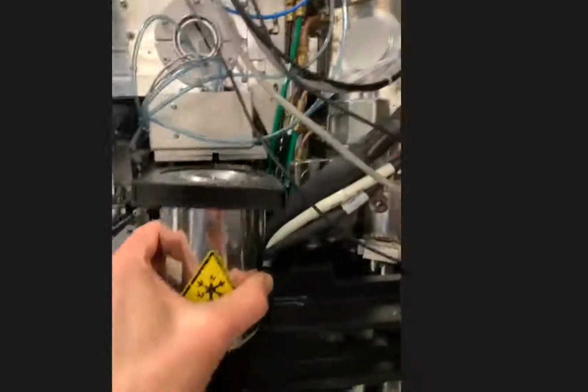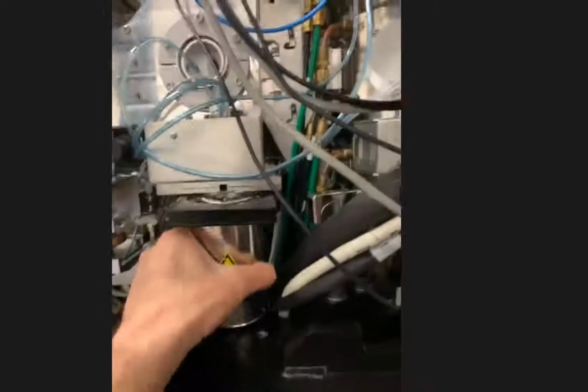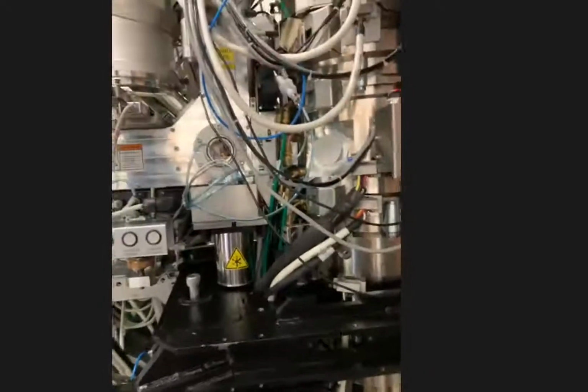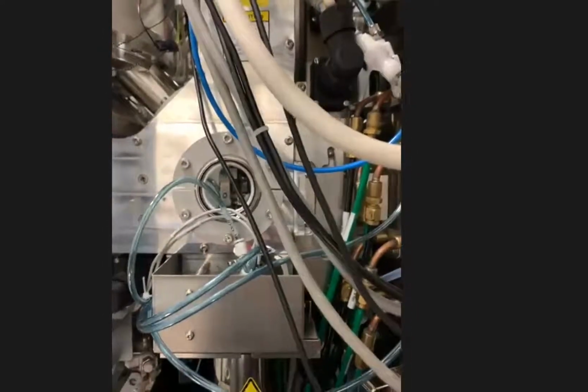I should say that this machine is shut down at the moment for repairs, which is why we can do this. And then you push that in there, you push it at the back, and then a robotic arm would come down. You can just see, perhaps through this little window, where the robotic arm is.